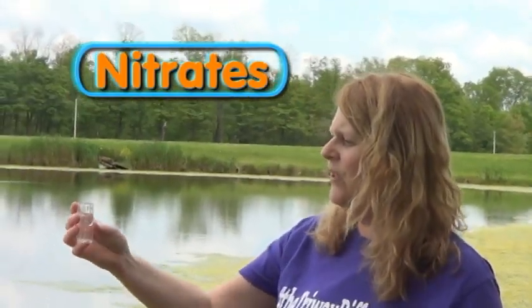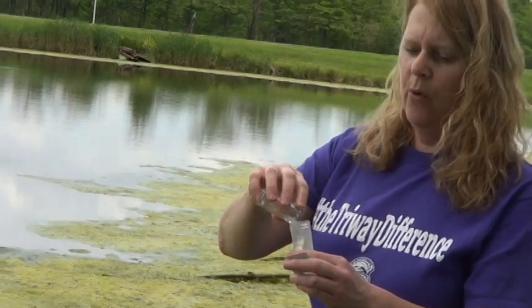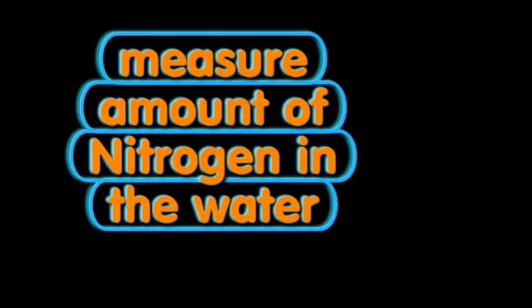Nitrate, so we need 15 milliliters of water, and I'm going to pour it into this cup here. Nitrates measure how much nitrogen is in the water. So we want an average amount of nitrogen. We don't want too much, but we want some. So somewhere between 1 and 2.5.